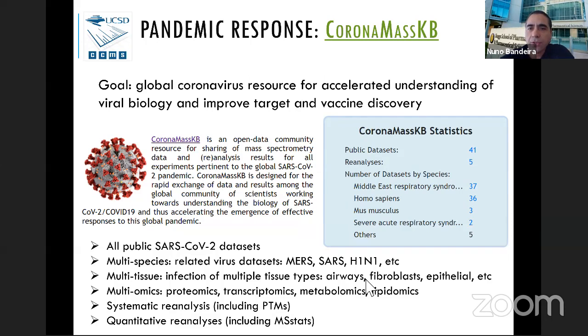The second question is, can we get a PRIDE ID if we submit to MassIVE? Note that what you need for publication is a ProteomeXchange ID, and things have gotten a bit confusing because the data set identifier PRIDE uses is the same as the ProteomeXchange identifier, but what you really need is a ProteomeXchange identifier.